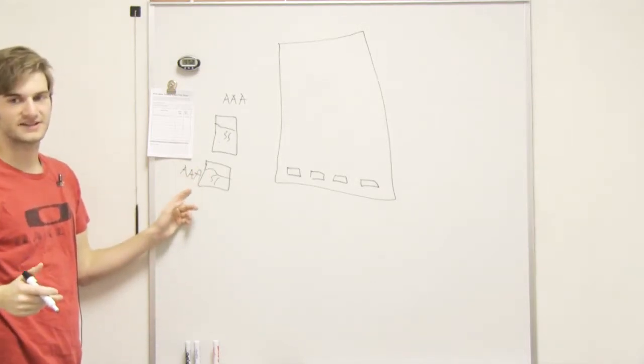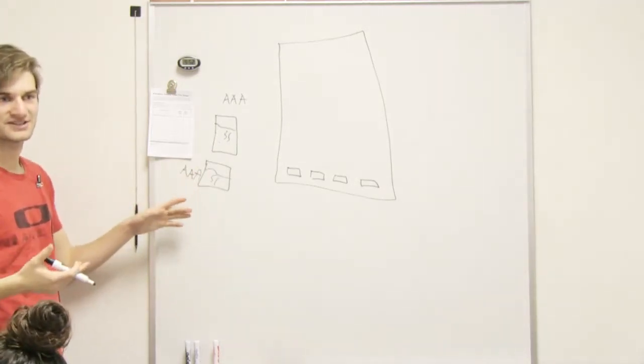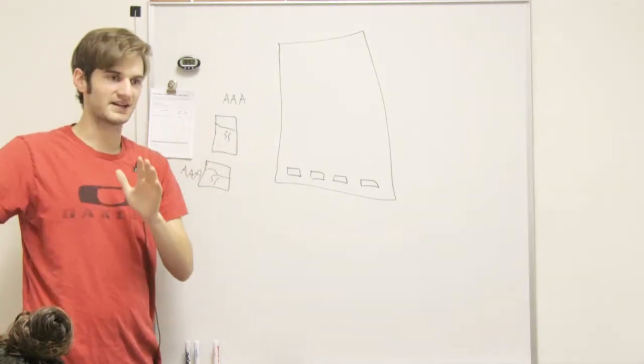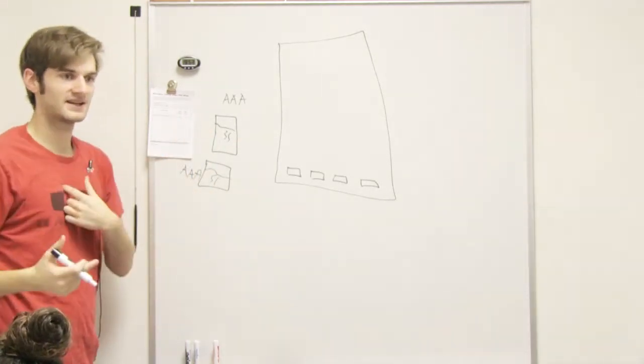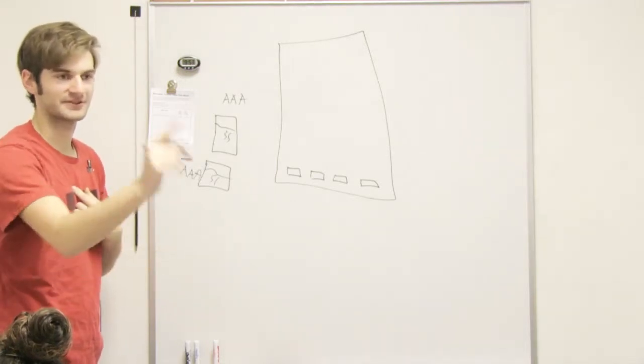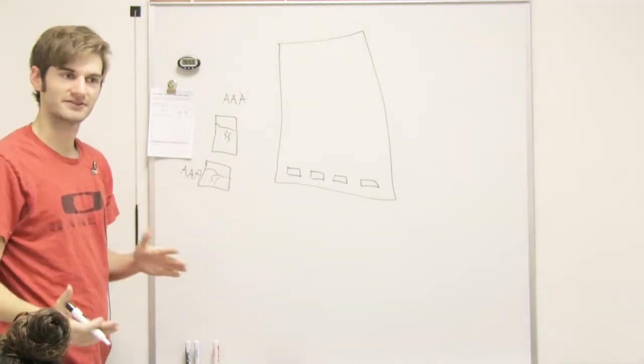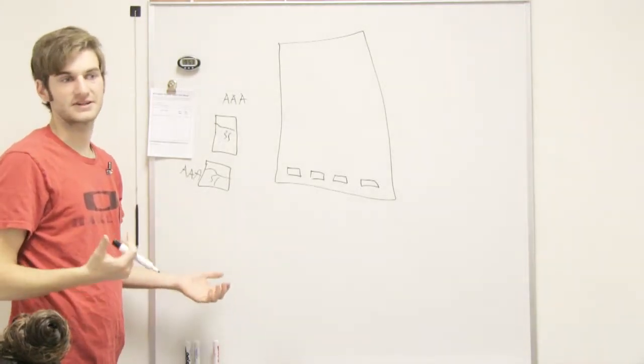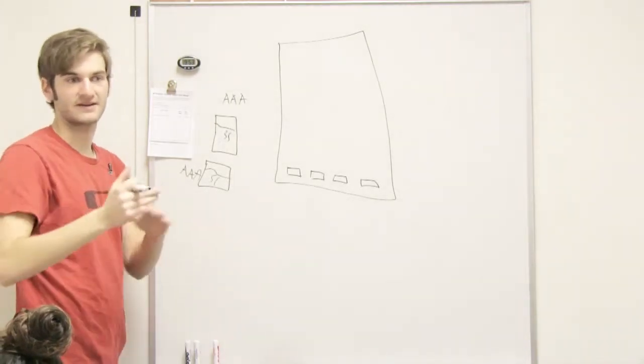That's important because there's no way of getting matches if you cut with different restriction enzymes, because you're looking for the patterns of the cuts. On my DNA, the AAA pattern is going to show up differently than on your DNA, so the cuts are going to be different. So they just use any random restriction enzyme? Yeah, but they have to use the same one. Okay, so the pattern is the same.